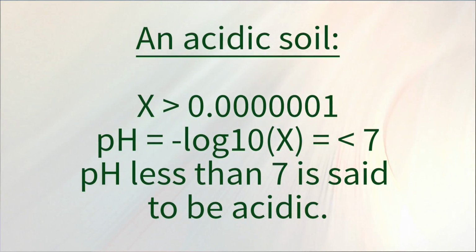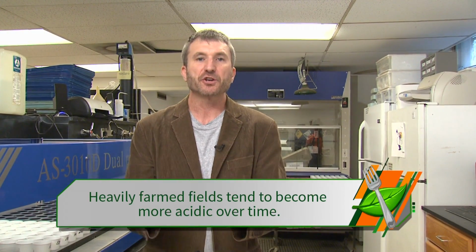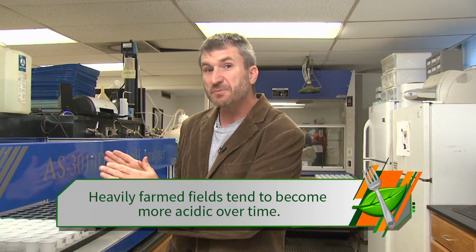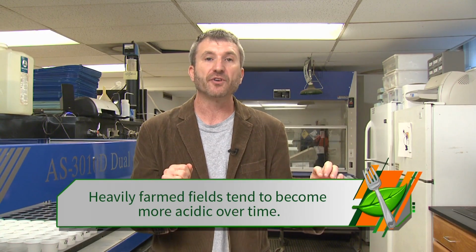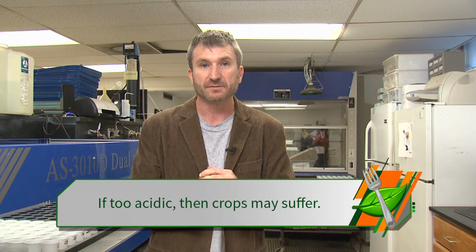Now, if you have a soil whose hydrogen concentration is greater than that of water, and you plug it into that equation, you're going to get a pH level less than 7. And anything less than 7 we would call an acidic soil. And that is one of the main problems with cropland. If you take a field that's been farmed over and over, it's going to accumulate more and more hydrogen ions in the soil. When this machine measures the pH, that pH level is going to go down, and it can go down far enough that plants have trouble growing or may altogether stop growing.